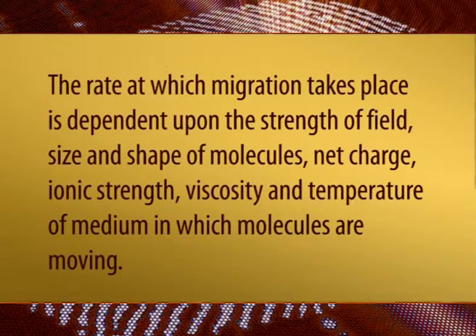The rate at which the migration takes place is dependent upon the strength of the field, size and shape of the molecules, net charge, ionic strength, viscosity and temperature of the medium in which the molecules are moving. As an analytical technique, it is rapid, simple and very sensitive. Besides being a separation technique, it is also utilized diagnostically to study the properties of a single charged species. It provides the basis for various analytical techniques employed in separation of molecules by charge, size or binding affinity.